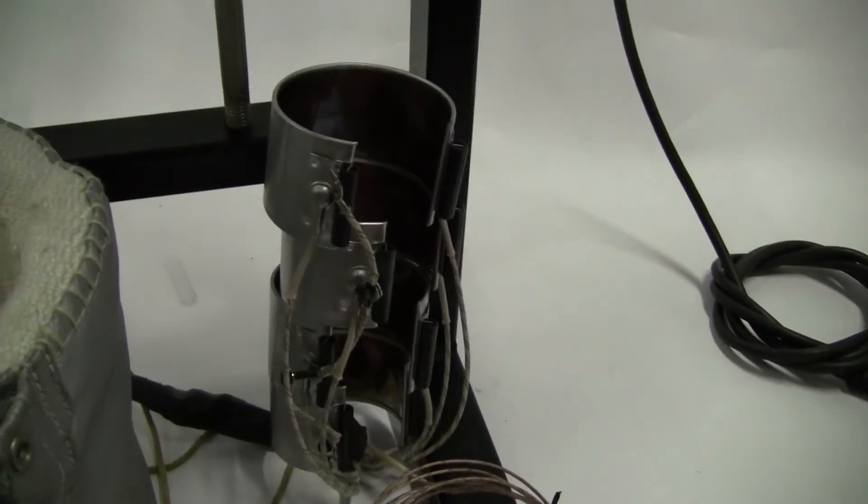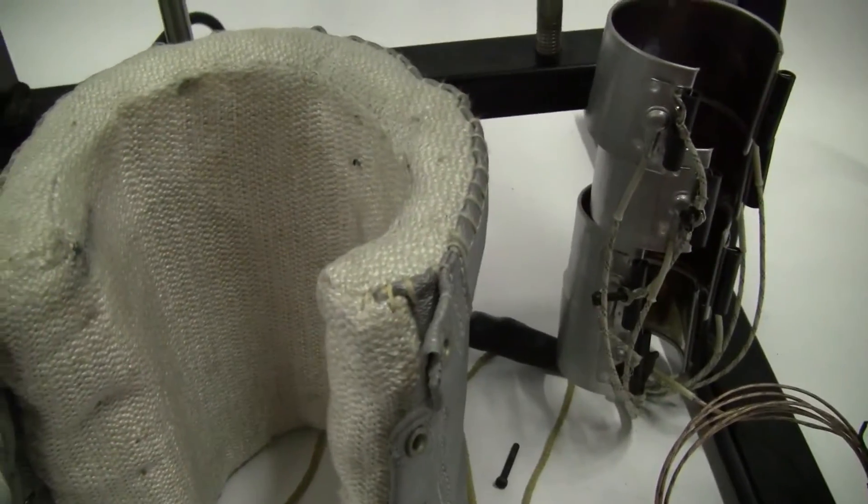Motor control. It's heated here. Insulator for the jacket.